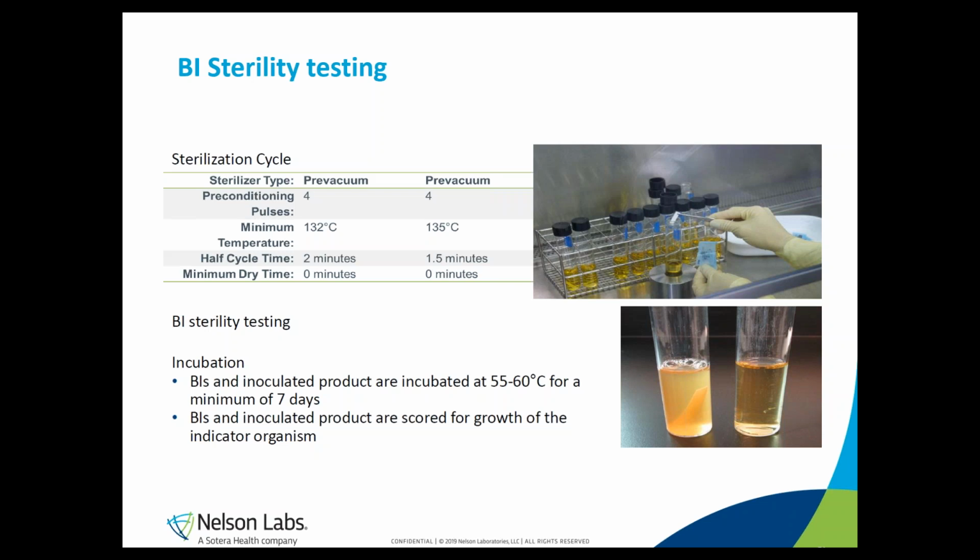After incubation, the growth medium vessels are all inspected for the presence of microbial growth. In the picture on the right bottom of this slide, you can clearly see the difference between growth in the left tube and no growth in the right tube. For a successful steam sterilization validation, we definitely want to have growth medium vessels without turbidity, as it is the case in the right tube.